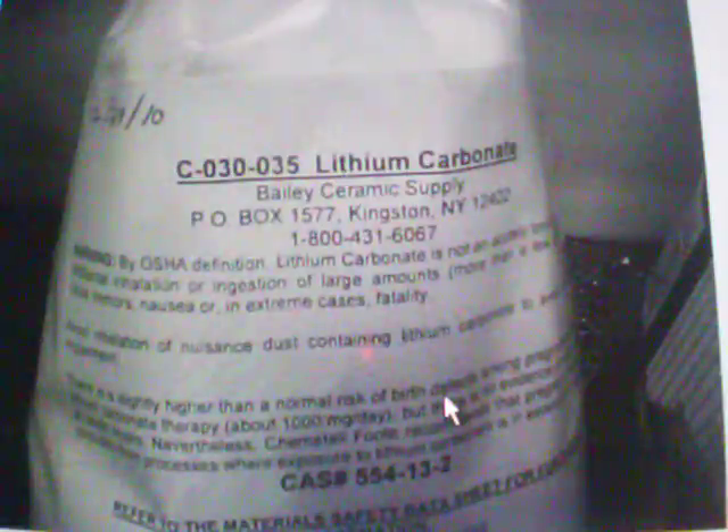Alright, here we go folks. Another tutorial. We're going to convert lithium carbonate into lithium hydroxide using a metathesis reaction between lithium carbonate and calcium hydroxide.